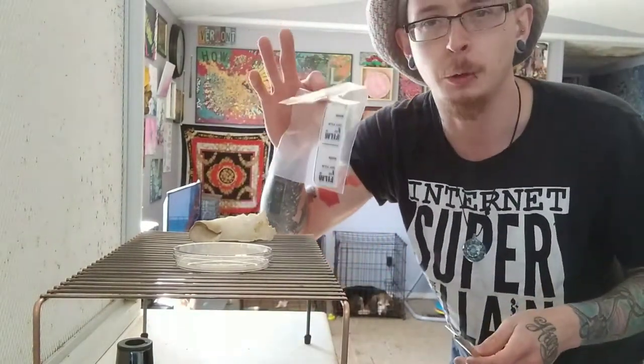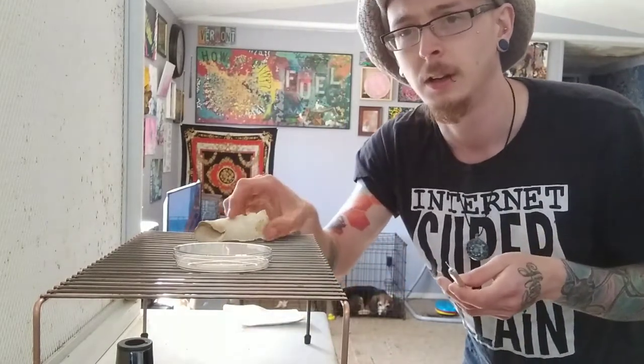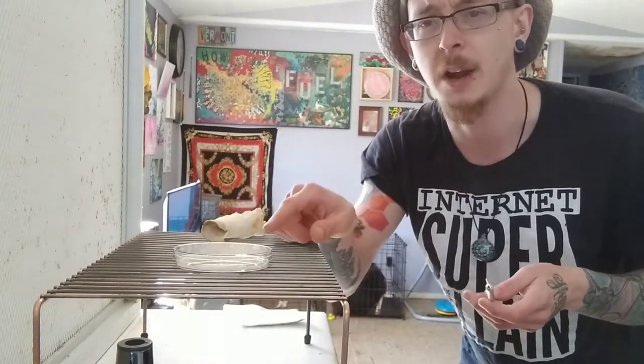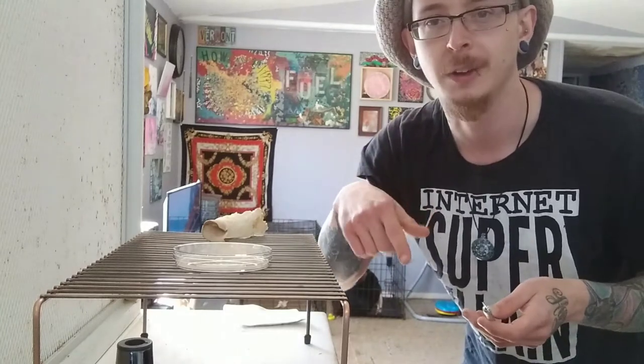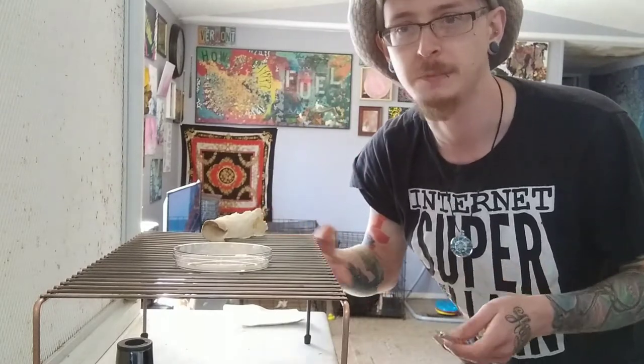You'll need parafilm. This is what we're going to seal the plate with once we transfer a piece of tissue from the mushroom itself. We're just going to add that right to the plate, close it up very quickly, put some parafilm around it, and then wait for it to colonize. And hopefully this mushroom culture will be the only thing that grows within it.